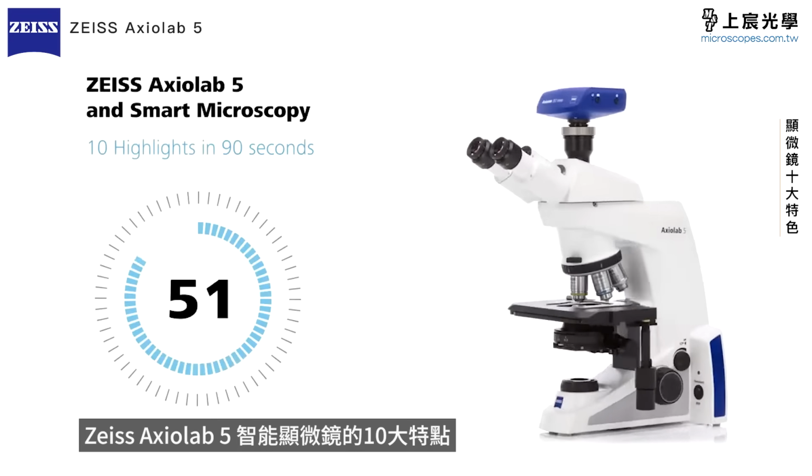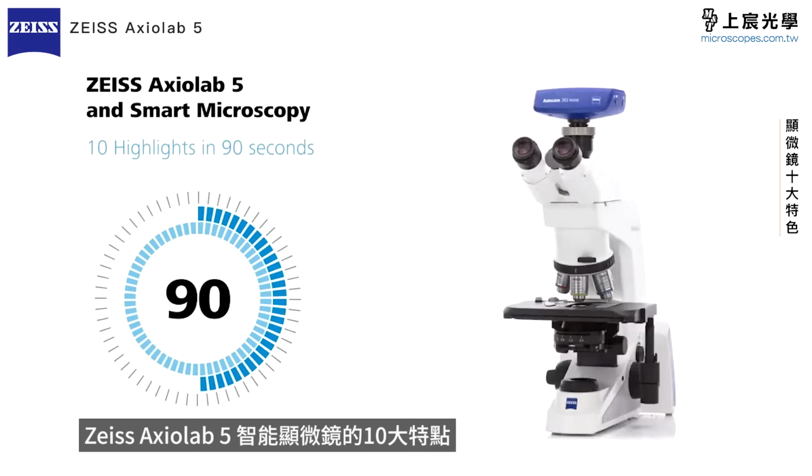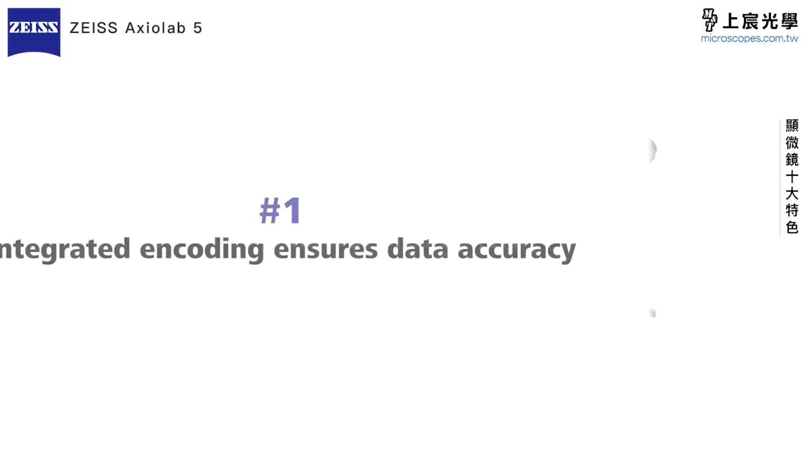ZEISS Axiolab 5 and Smart Microscopy. 10 highlights in 90 seconds.